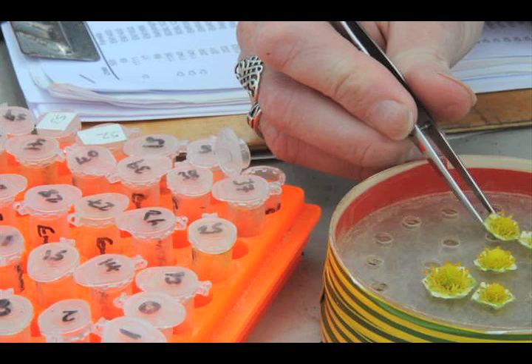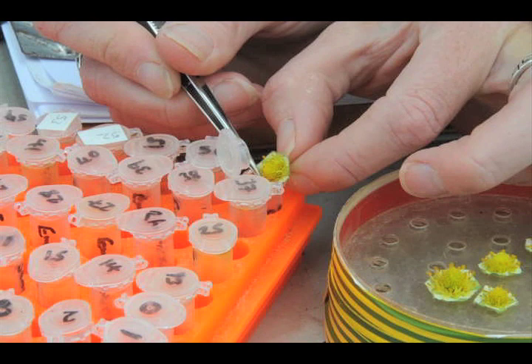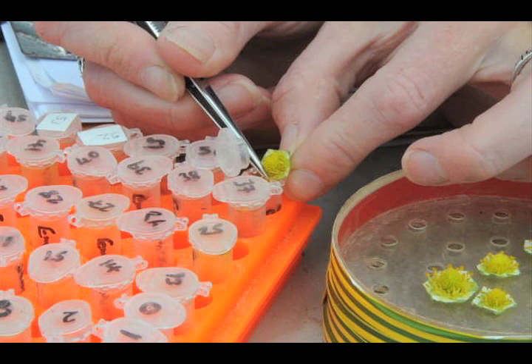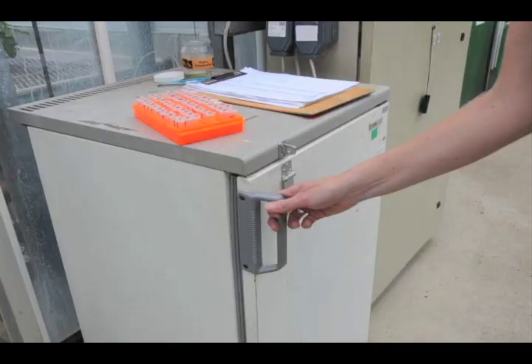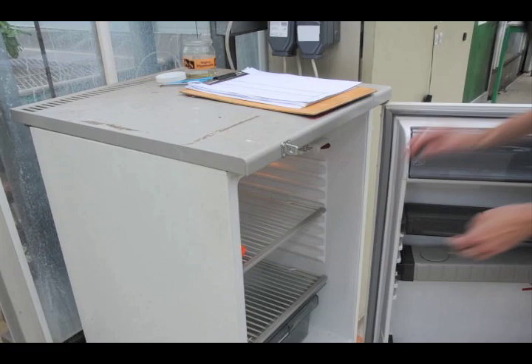Often, the pollen from the chosen cross is placed in an eppendorf tube for later use. The anthers with the pollen are carefully pulled off the flower and placed in the eppendorfs. These are then stored in the fridge, which keeps the pollen fresh for later use. All of the eppendorfs are carefully labelled so that no contamination from another flower can take place.